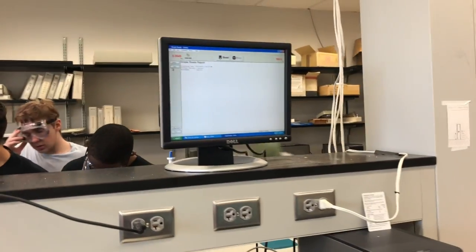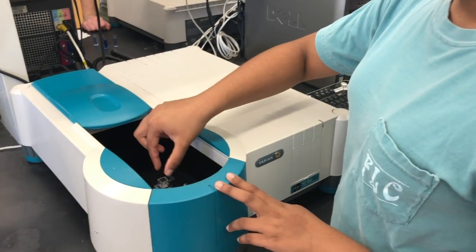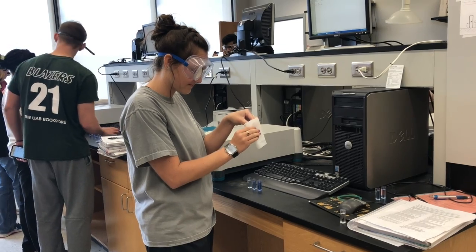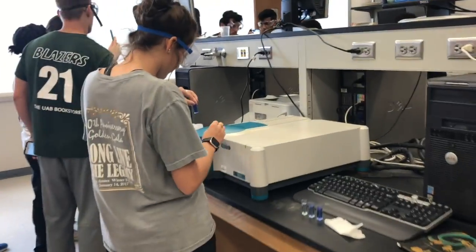Then, we made sure to hit the zero button to negate the effect of the ammonia in our solutions. Next, we carefully opened the lid, removed the blank cuvette, and then we closed the lid. After zeroing out the spectrophotometer, we were then ready to scan the samples.